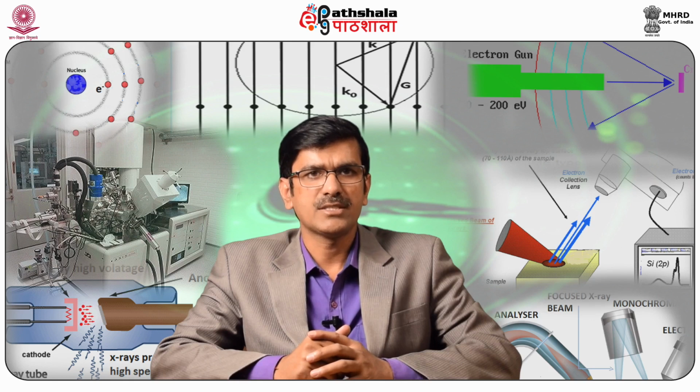Hydrogen also has an extremely small photoelectron cross section and suffers from having to share its only electron in forming compounds, which then resides in a valence-like orbital.